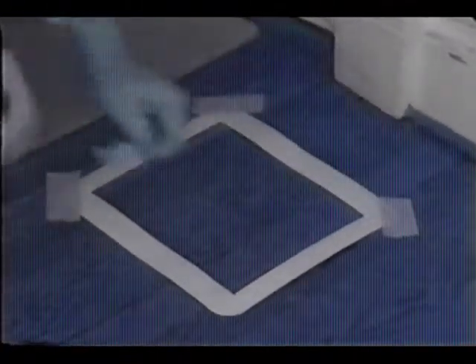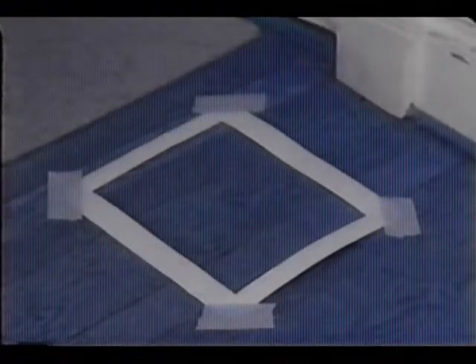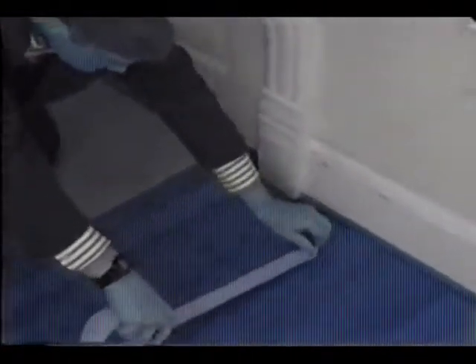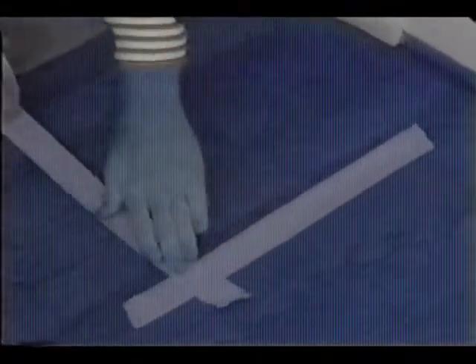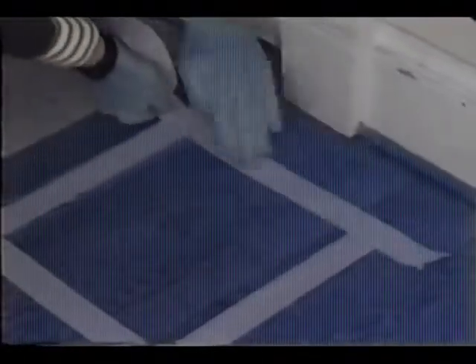The area does not need to be exactly 1 square foot, but you will have to measure it exactly after taking the sample. If the area has a lot of debris or dirt, reduce the sample area. Remember, since you will measure the area sampled, the area need not be exactly 1 square foot. Reducing the area will enable you to better collect all material that's within the defined wipe area.